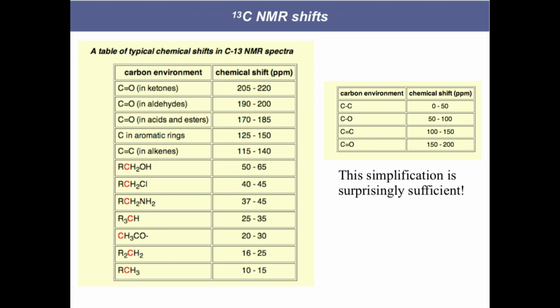Here are the ranges of carbon 13 shifts. Remember, in proton NMR, we looked at all the different types of protons from primary to secondary to tertiary to methyl ketone to aromatic to acetylenic to alcohols to amines to aldehydes to carboxylic acids. We looked at all those ranges where they would shift in ppm relative to TMS. Here are those types of shifts for carbon.